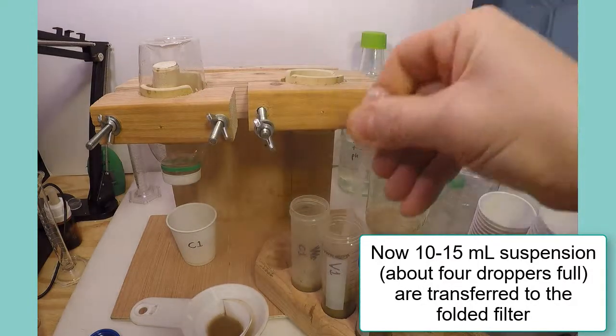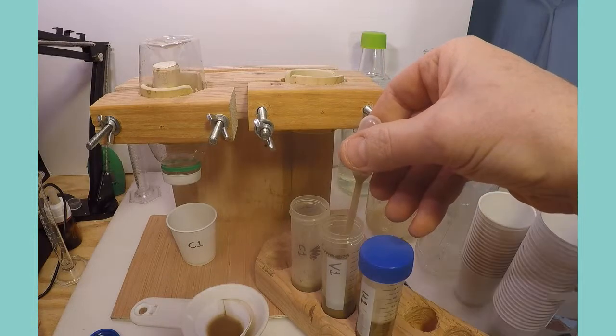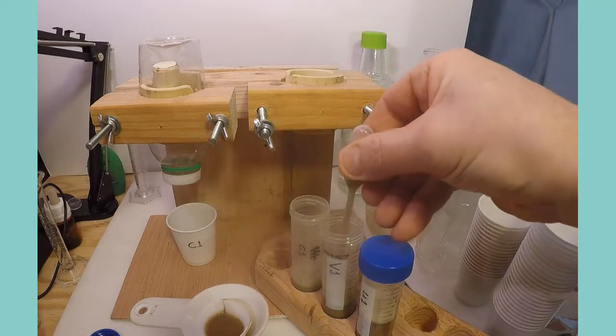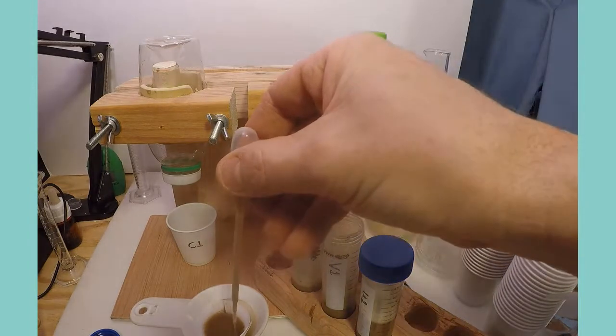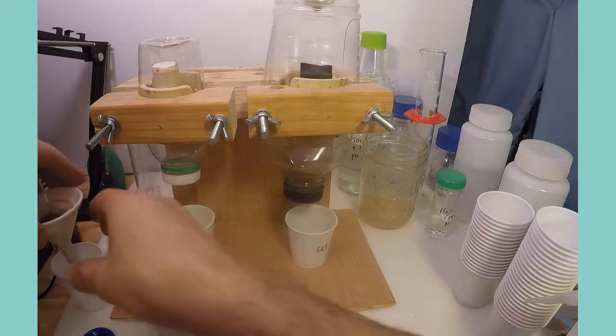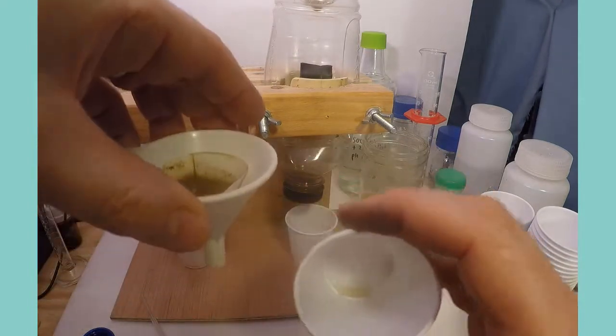If many samples are filtered at the same time in this way, the filtration should be started and stopped in the same order of samples, since the Olsen solution will continue to extract available phosphorus during the longer filtering process, and the additional time should be standardized.